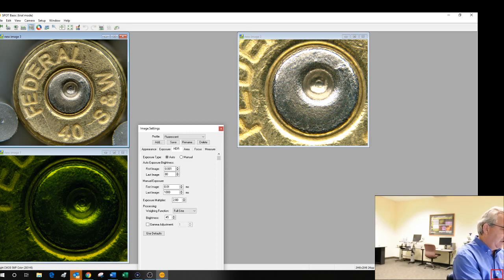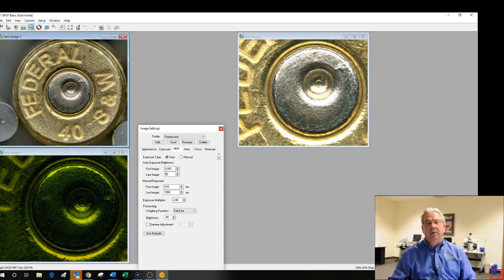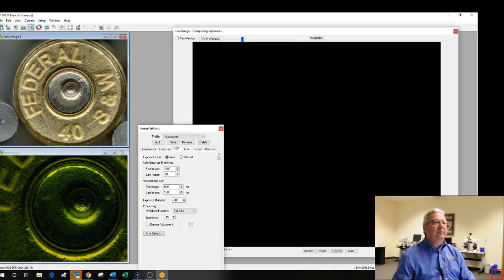If you give me 1 second, I'm over working on the LCF here, changing the sample that we're looking at, and opening up my live window again.